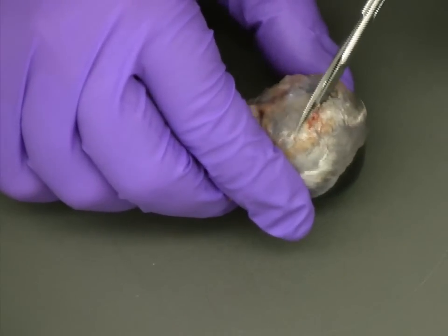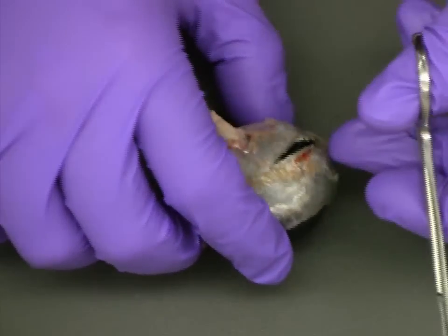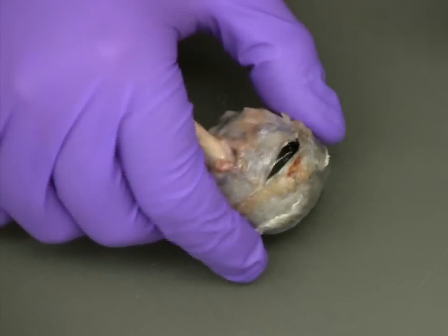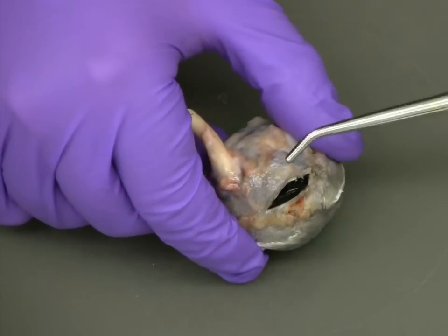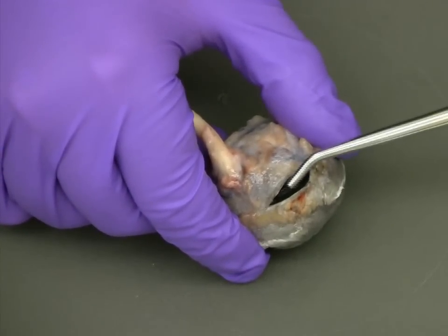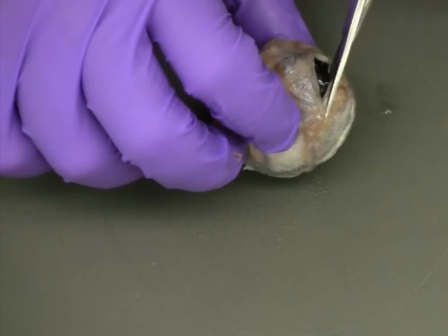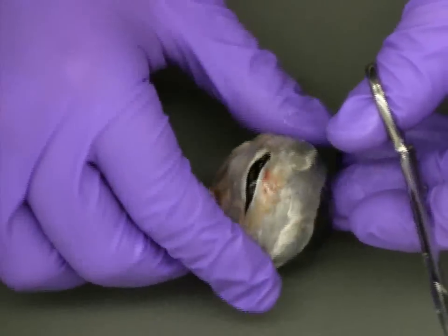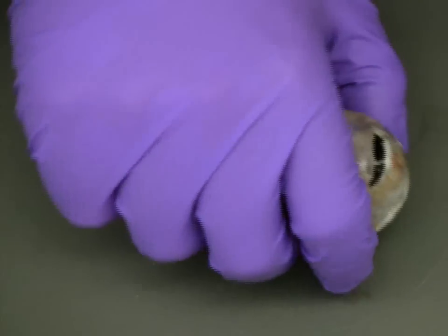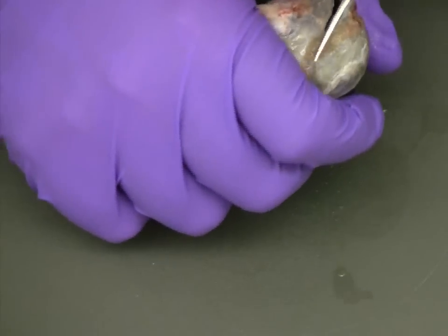Once you begin cutting around the circumference of the eye, you will begin to expose the jelly-like vitreous humor. As you continue cutting around the eye, the vitreous humor should start to leak out. This makes the exterior of the eye somewhat slippery, so caution is important when you're finishing your incision.